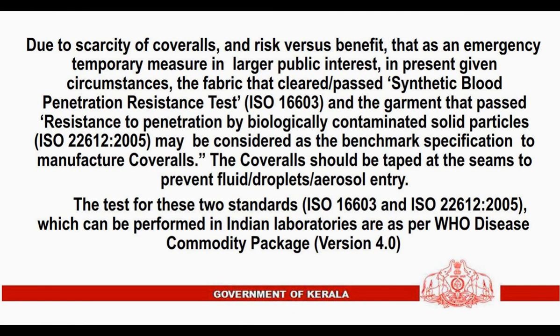Due to scarcity of coveralls, and risk versus benefit, as an emergency temporary measure in larger public interest, in the present given circumstances, the fabric that cleared or passed the synthetic blood penetration resistance test, ISO 16603, and the garment that passed resistance to penetration by biologically contaminated solid particles, ISO 22612:2005, may be considered as the benchmark specification to manufacture coveralls. The coveralls should be taped at the seams to prevent fluid or droplets or aerosol entry.